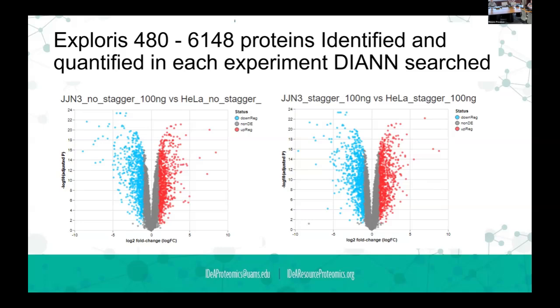Okay. Yeah. So what I did is I changed, for this, the output from DIANN. I can't remember if the output from DIANN just leaves blanks or if it has NANs. But anyway, I changed those to zeros. If you look at that report too, at the bottom, it gives you the total protein IDs. If it's different, then you'll also know if it's staggered versus non-staggered. So in this particular experiment, we ended up with about 6,100 proteins identified for each, whether it's staggered or unstaggered. It turned out to be the exact same number of proteins, which was something.